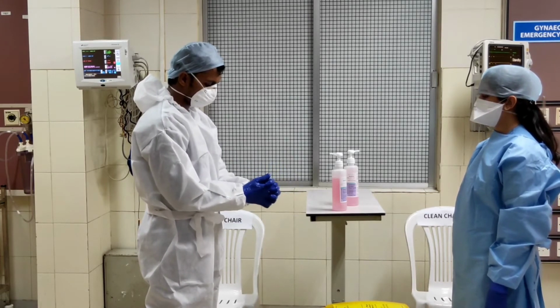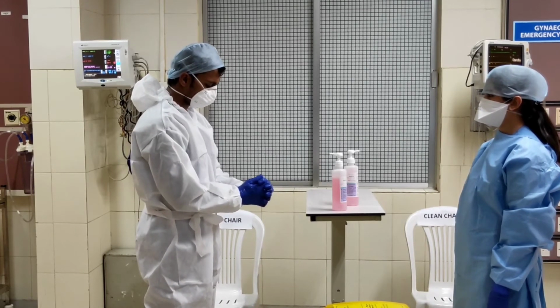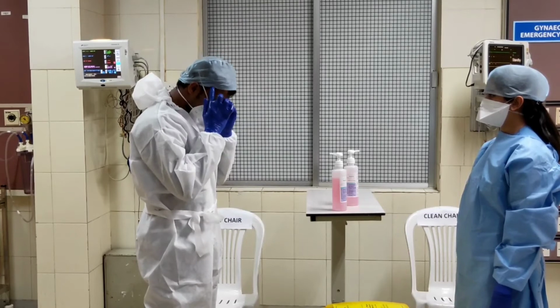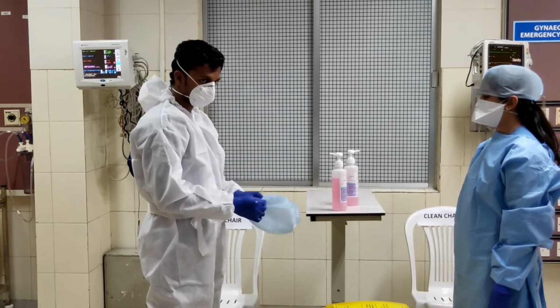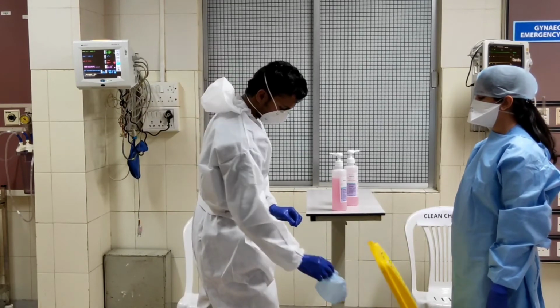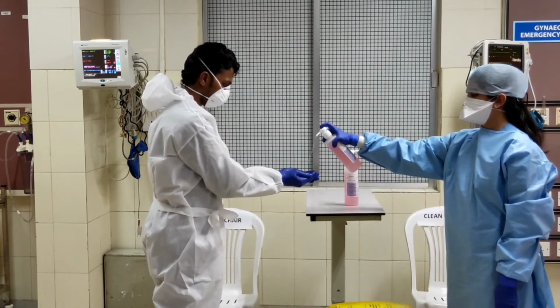Once you have disinfected your hands, you can remove the surgical cap from your head without touching the outer aspect of the surgical cap. Remove it and discard it. Again, disinfect your hands.